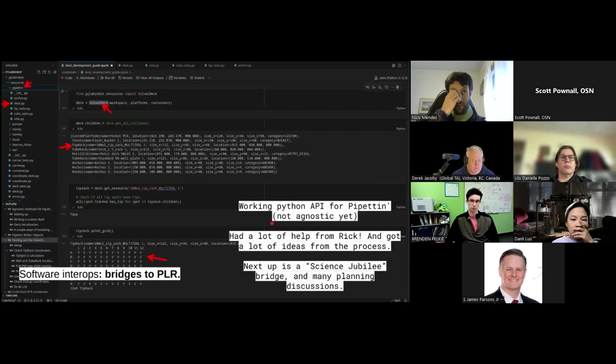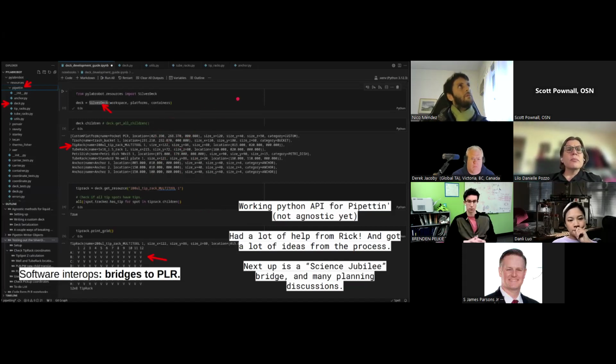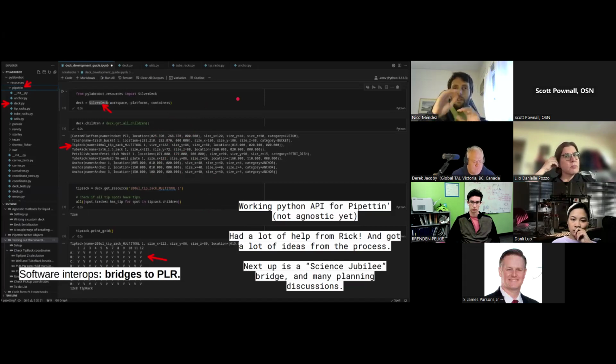And then the interesting slide here is that actually for a couple of years now, very slowly, I've been working on adding compatibility of our robot with PyLabRobot, which is a Python API meant to drive different robots with a common syntax. So you will use the same Python script. The middle part of the Python script defining the protocol will be the same, and then you will have a small bit on top defining what robot you're using and what deck you're using.